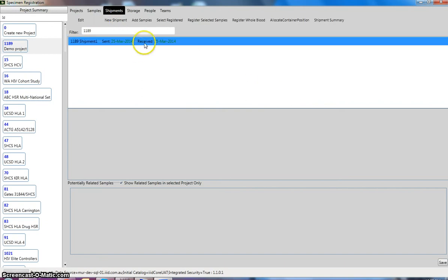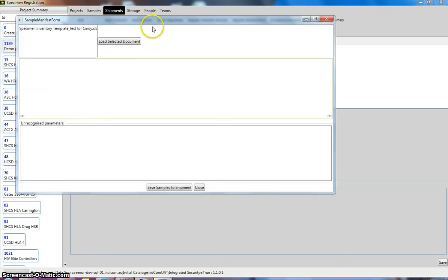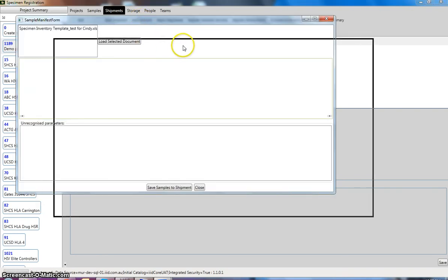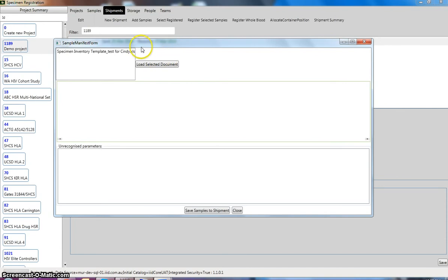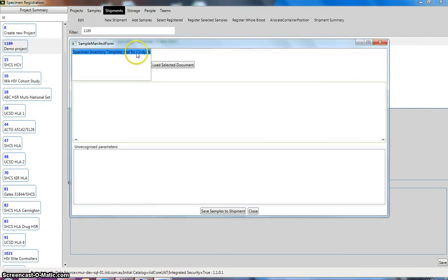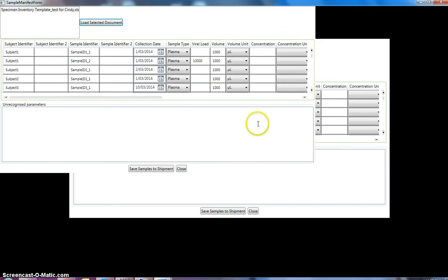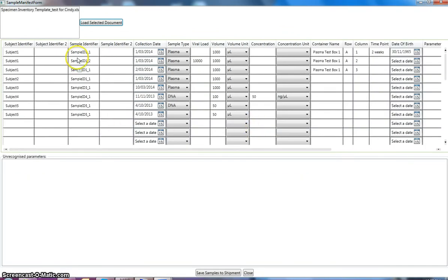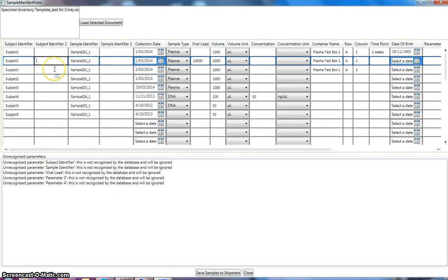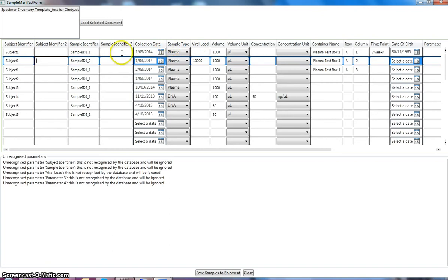And we select that shipment and then go to the add samples. This is where we import the samples into our shipment. So we select the document that we've just assigned to our shipment and click on load selected document. So in this instance, we can see that this has just imported the list of samples directly from our spreadsheet.